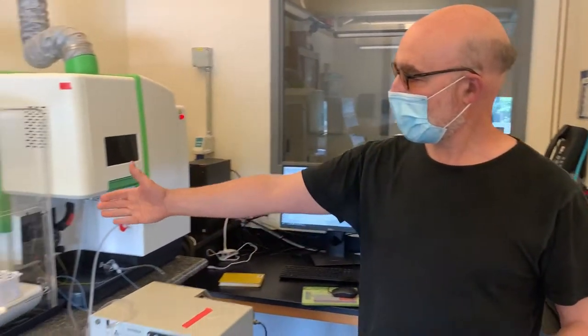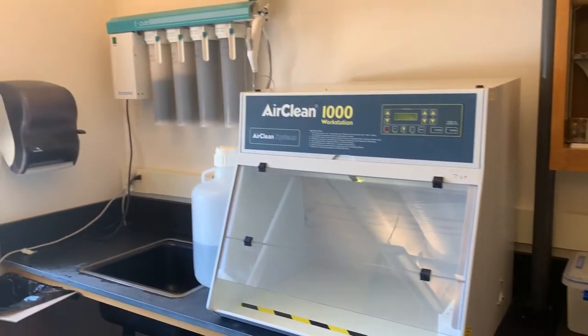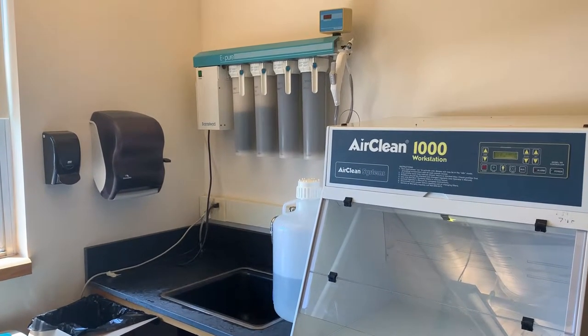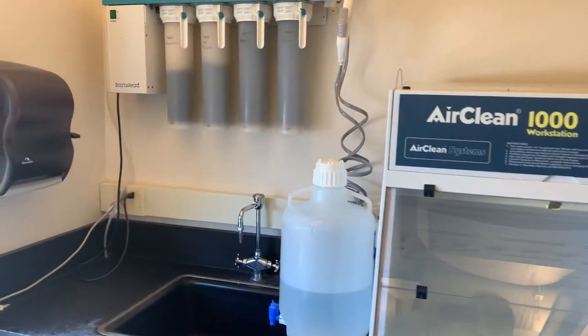We also use them to understand what's in rocks. And we do that by digesting rocks in strong acid and getting those rocks into a liquid solution. So most ICPs work on liquids. There are ICPs with lasers capable of working on solid materials. But here we're going to be working entirely on liquids. So this laboratory, as we look around it, is set up to work in liquids. We have auto samplers of old test tubes. We have a small tube hood for doing dilution. We have clean water source on the wall over there for making clean water that does not have many elements in it at all. So we use a series of cartridges to absorb anions and cations that are in those water.